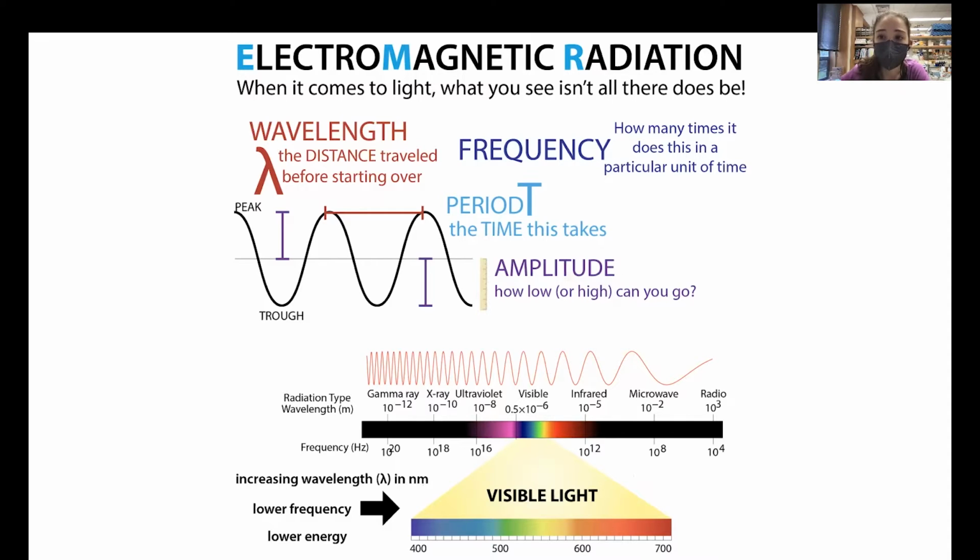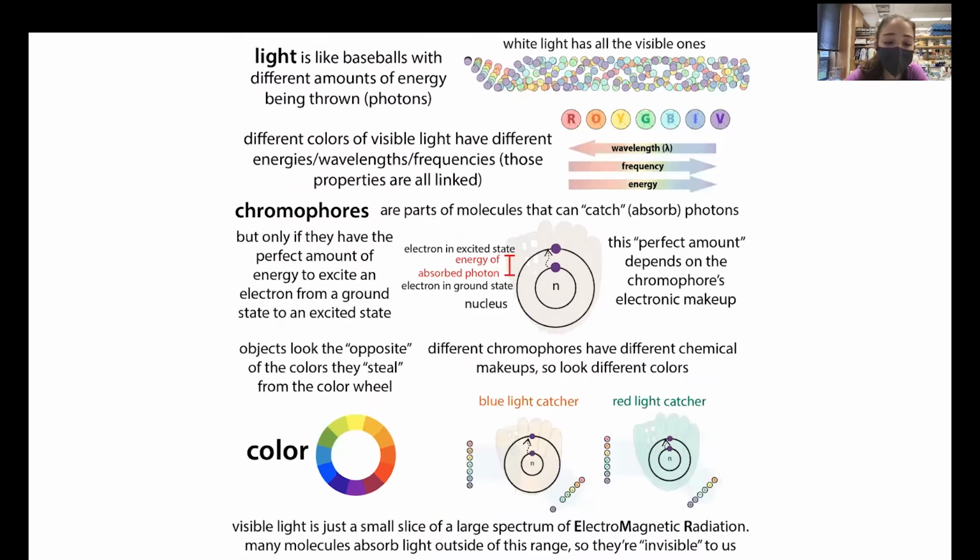Okay, so why am I telling you all of this? Because light is going to interact with molecules. Light of different wavelengths has distinct energy in its photons.